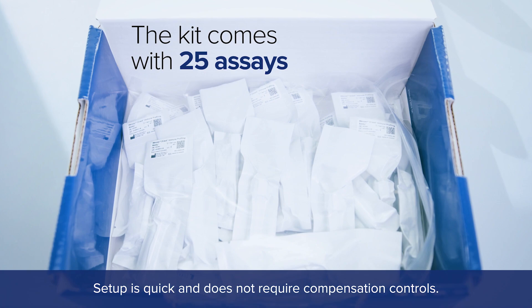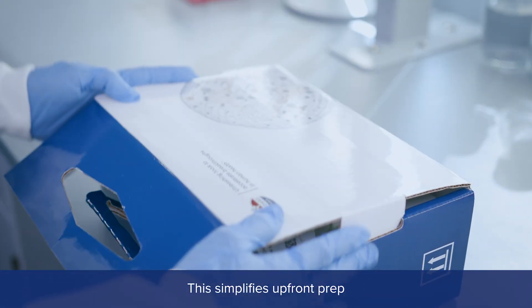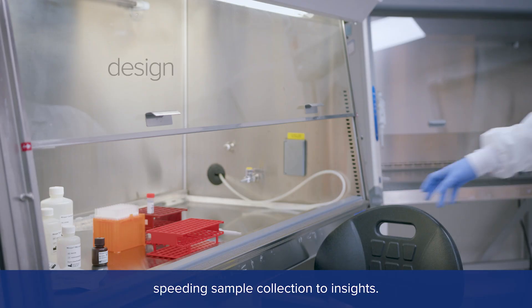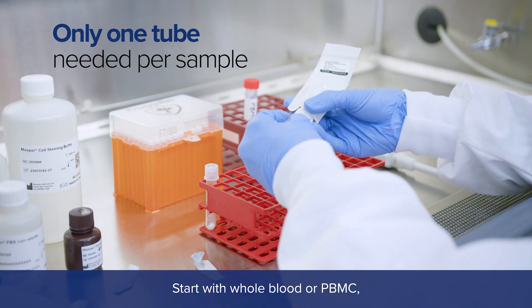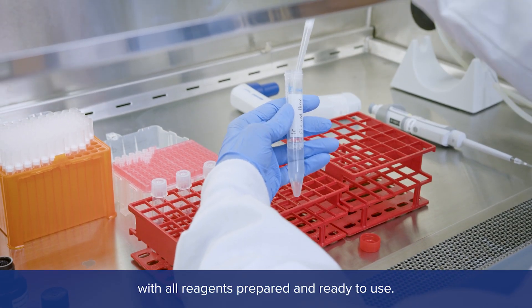Setup is quick and does not require compensation controls. This simplifies upfront prep that can take days and weeks with conventional fluorescence, speeding sample collection to insights. The kit has all you need. Start with whole blood or PBMC, with all reagents prepared and ready to use.